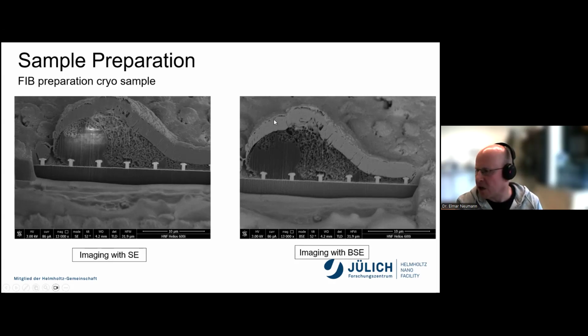What stands up on the structure will stand up even at the processed surface, even though the original particle is gone, but it has protected the underlying layers, leaving behind these grooves, these scratches.